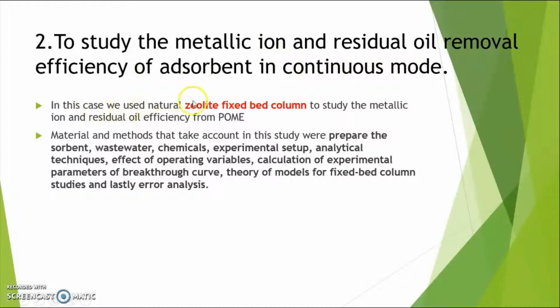In this case, we use a natural zeolite fixed bed column to study the metallic ion and residual oil removal efficiency from POME. The methods taken into account in this study were preparing the sorbent, wastewater, and chemicals, experimental setup, analytical technique, effect of operating variables, calculation of experimental parameters of the breakthrough curve, theory of models for fixed bed column studies, and lastly the error analysis.